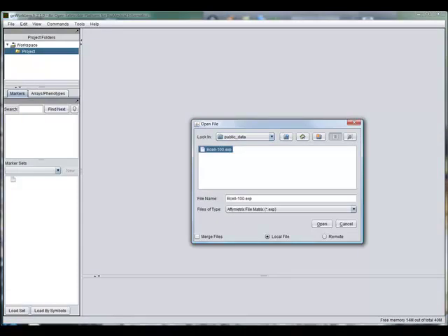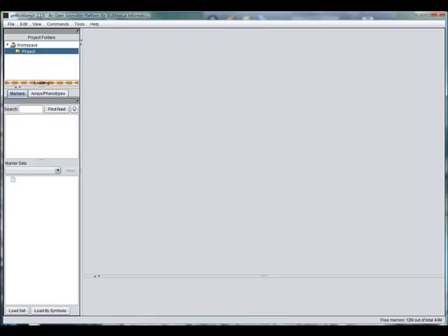The test data we're going to use is B-cell 100. It contains gene expression data from 100 arrays, and it's a subset of 340 arrays from the original ARACNe paper. And the platform is Affymetrix U95. So we click on Open.